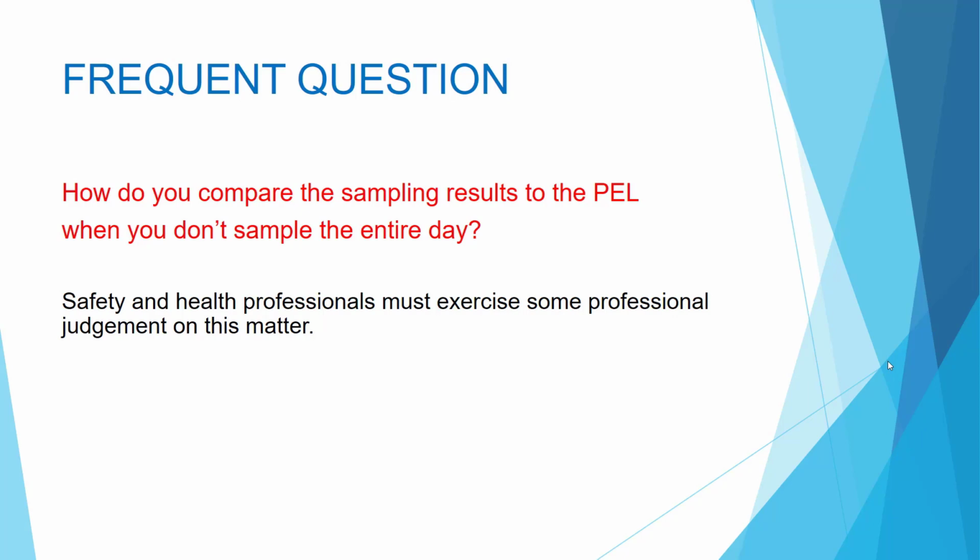But a frequent question from those new to air sampling is this: how do you compare the sampling results to the PEL when you don't sample the entire day? In this scenario, the safety and health professional must exercise some professional judgment. In short, why didn't you sample the full 8-hour shift?